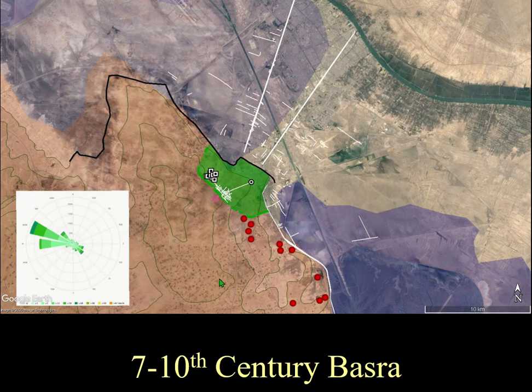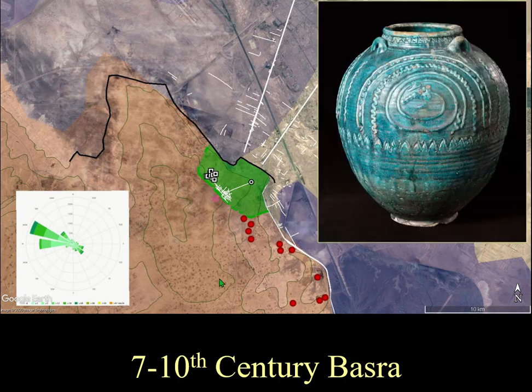So this may explain something I find in the petrography, because certain types of pottery, like all of the lusterwares and all of those blue painted wares, have the same petrofabric, the same petrographically defined fabric. So it would suggest to me that they are from the same workshop.